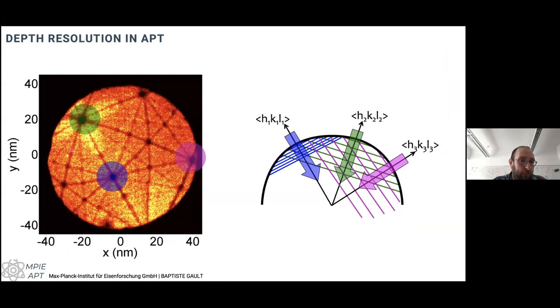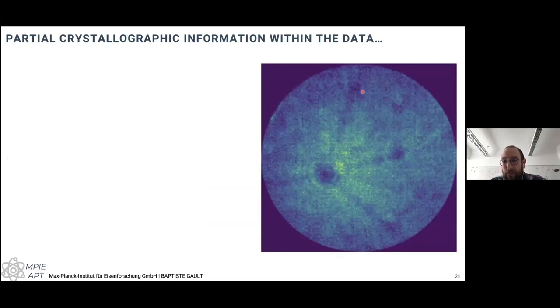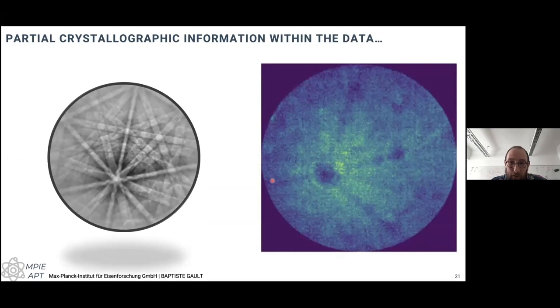That's a typical image from the detector for an aluminum tip. You can see here beautiful threefold symmetry. And as you start thinking about it, you'll be like, oh yeah, I've seen similar things before, like a Kikuchi pattern, which is useful for indexing in EBSD maps, for example, or in the TEM. This is in the recipe, like due to diffraction or going through the reciprocal space. This is all in real space, just related to the symmetries of the crystal in real space.